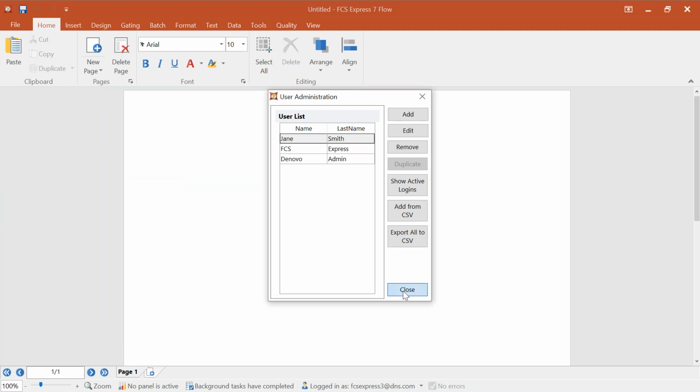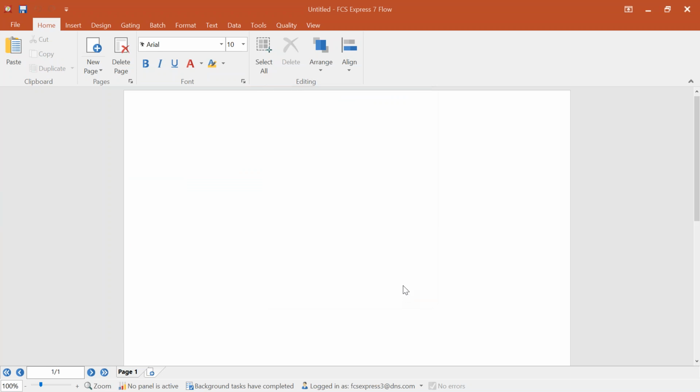So we're going to close out of this window, and we're going to discuss now some of the online self-registration tools. And the online self-registration tools are really great, especially if you're a core facility manager or you're managing a license that's going to have lots and lots of users on it. Because when somebody asks you to join the license, you can essentially send them one email, and the email will have a link to register for the site license. It will have all of the information that you want to provide them to download, install, and configure FCS Express.